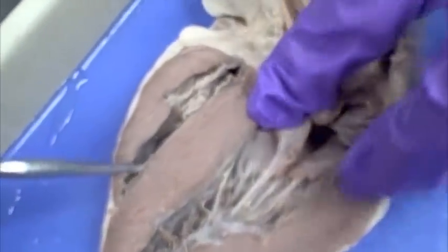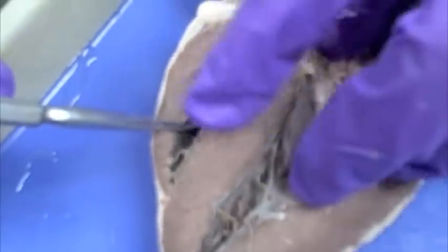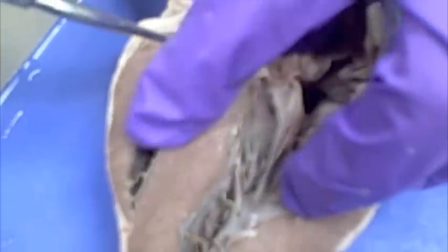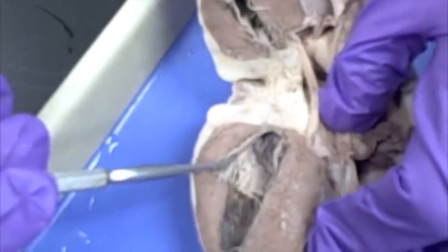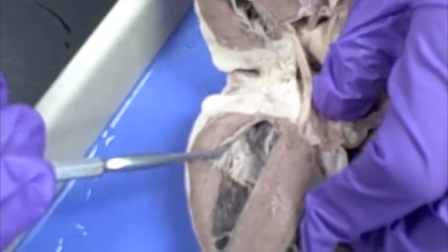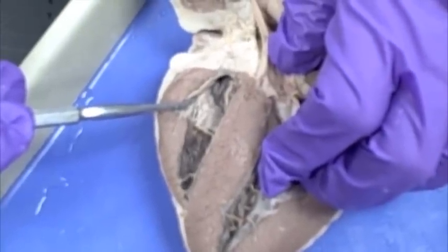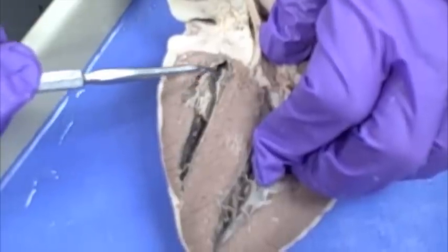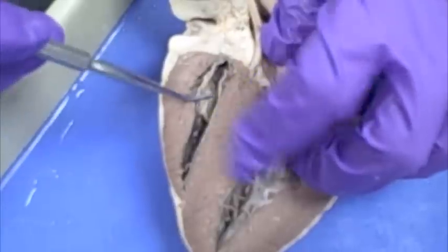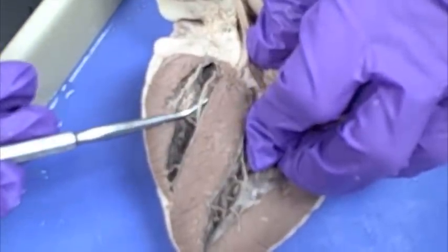If you separate it just a little bit on the right side, you can see that the chordae tendineae from the valves are above the ventricle. So this area up here, where the top of the probe is, is the right atrium. The valve located between the right atrium and the right ventricle is the tricuspid valve, and that's what you see here. You can see that the valve is really floppy and there are several string structures attached to it — those are called chordae tendineae.